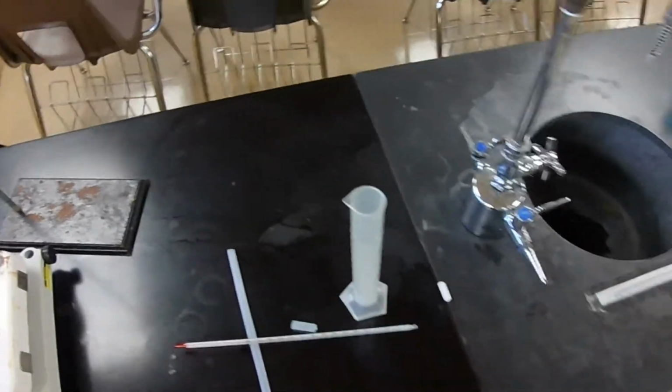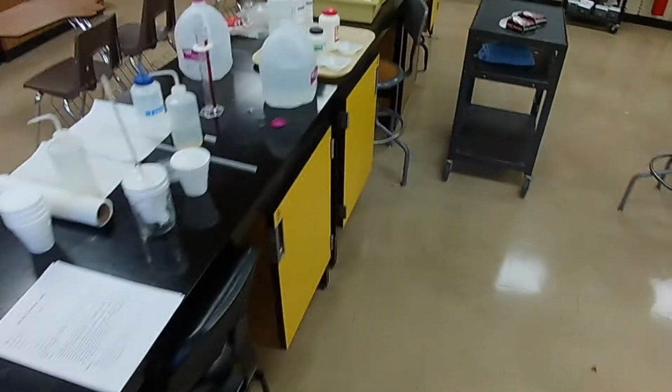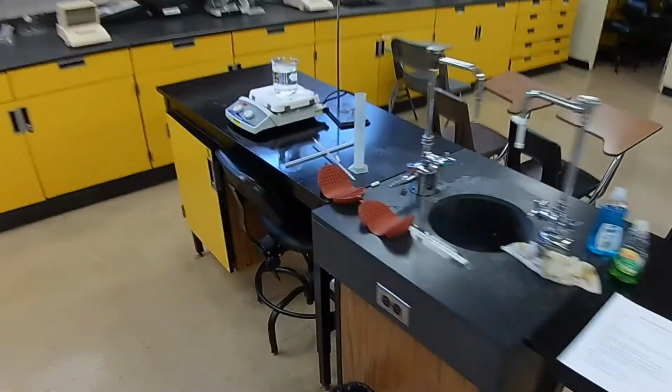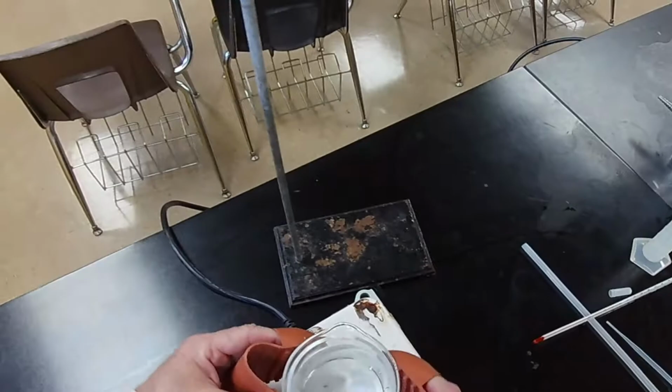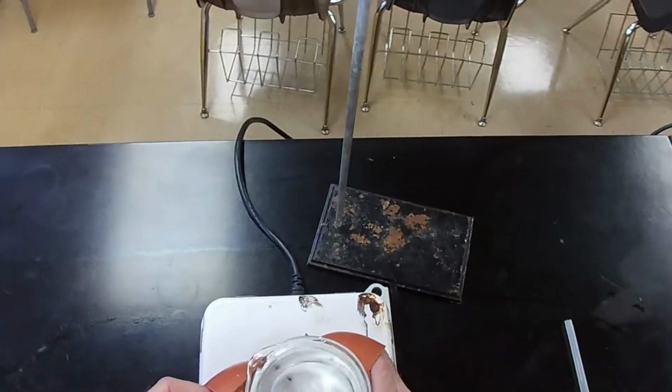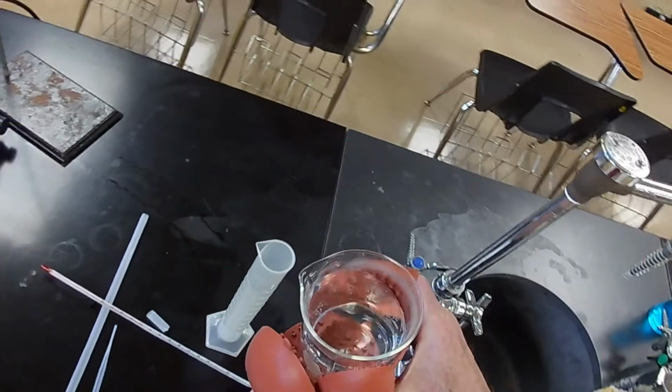So this one's going to be a little more difficult to pour to the right mark, and I'm going to use, let's see, here. I'm going to use a transfer pipette to get the last little bit in there, because I want this to be accurate. All right, so I need my hot hands. Maybe I can do it with one hand. I'll just support with the other one. All right, so I need 75 milliliters.